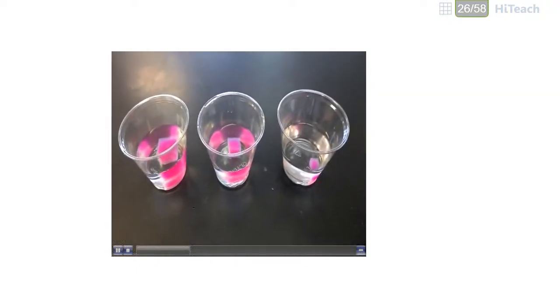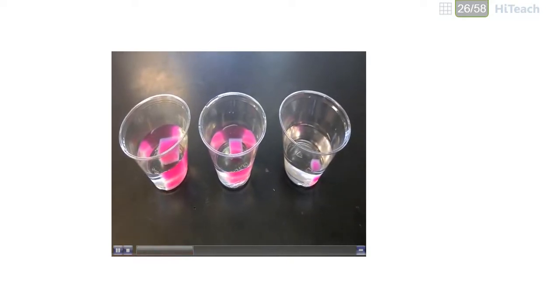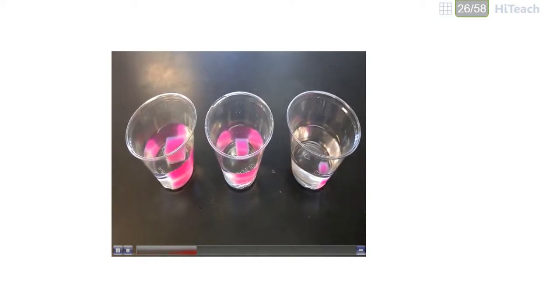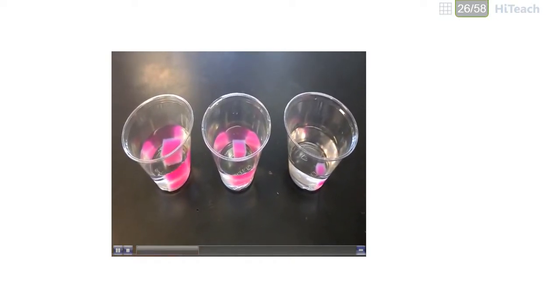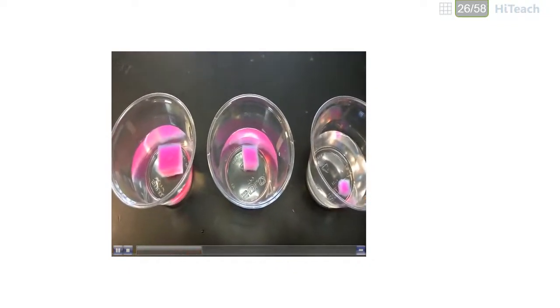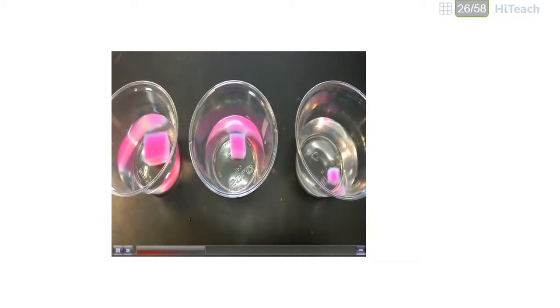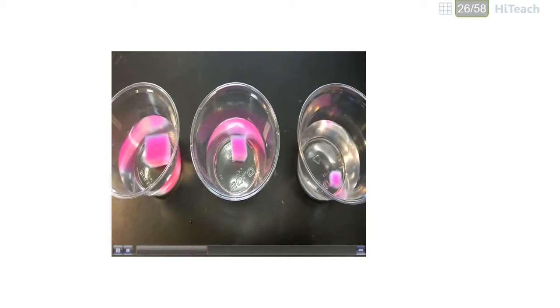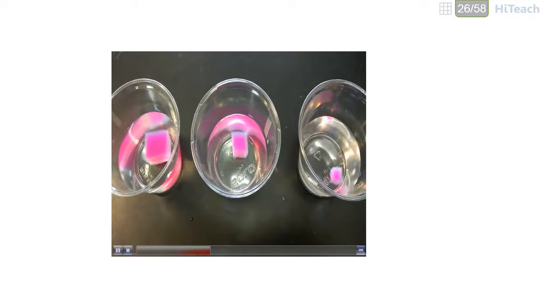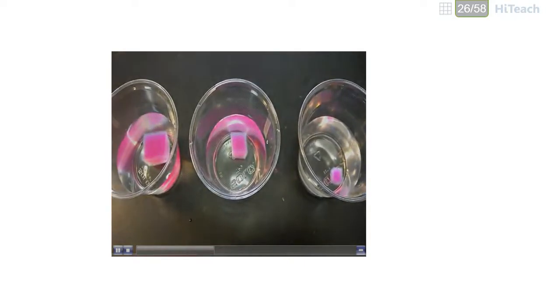So here we have all three cubes in cups, and inside the cups is dilute acid. The acid is interacting with the phenolphthalein to take the color out of the agar as it diffuses across the membranes. You can see the three cubes, and you can watch the diffusion occur right in front of your eyes. This is at about 30 seconds after I drop the cubes into the solutions, and we'll take a look back in about a minute.